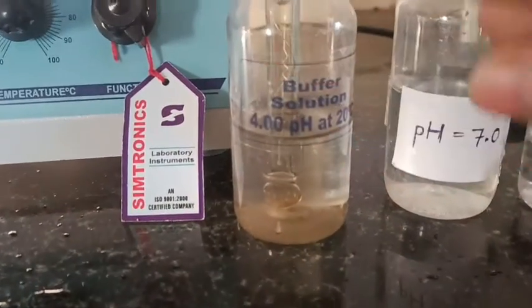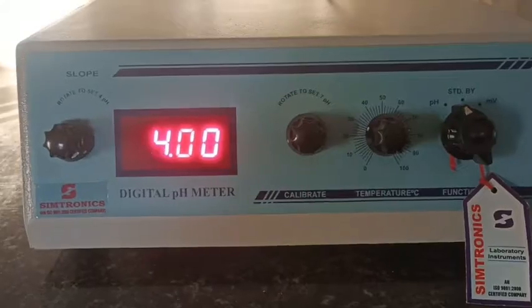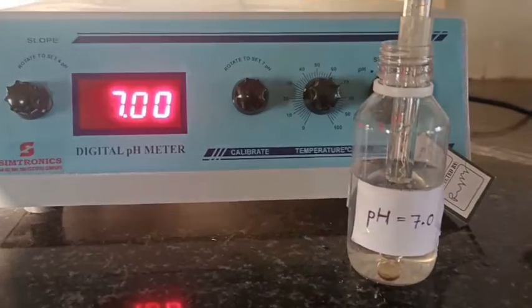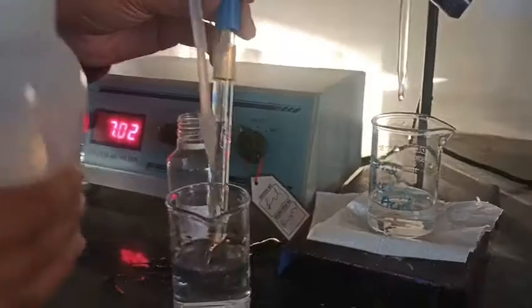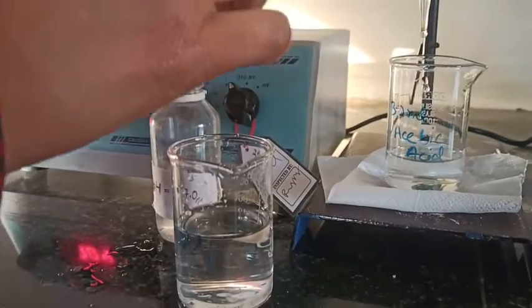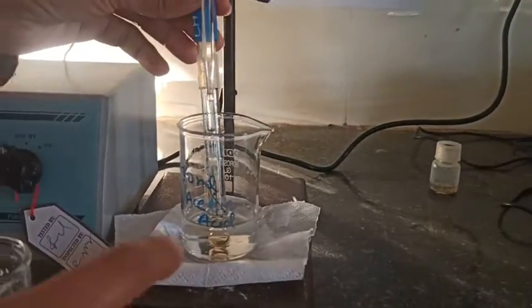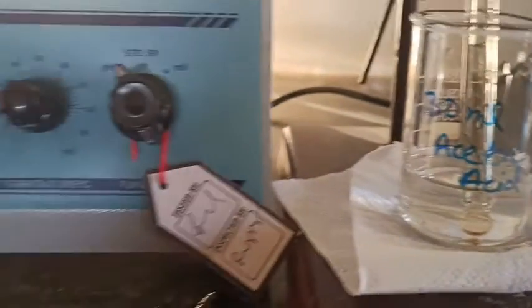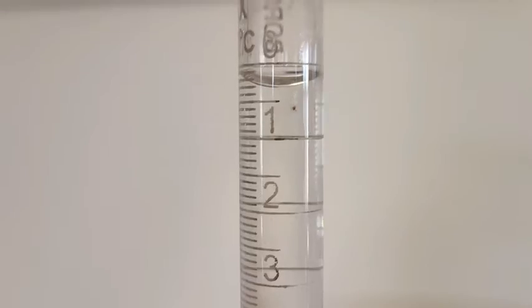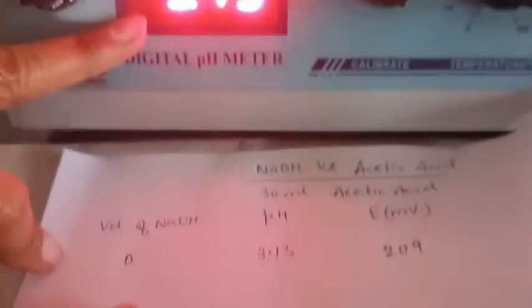Now I'm placing the electrode in pH buffer solution 4 just to check the calibration. After that I wash it thoroughly with distilled water and keep the electrode in 30 ml of acetic acid solution. The initial pH reading for this 30 ml of acetic acid is 3.13.